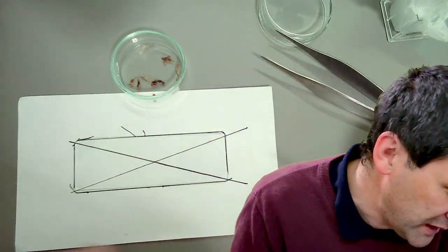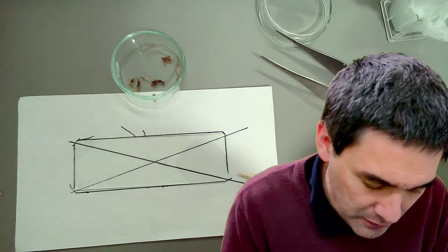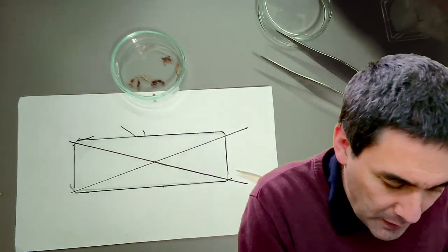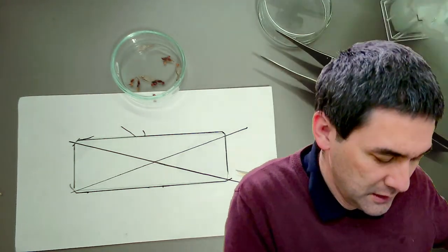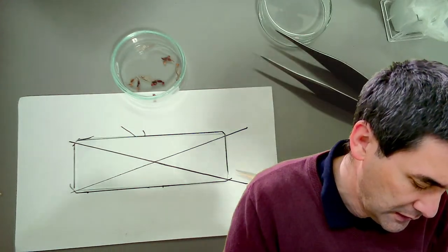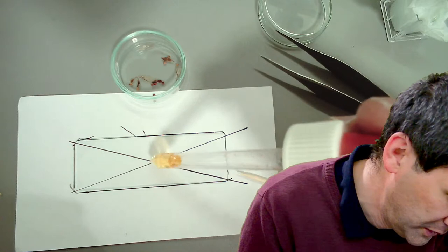So let's try it again. Let's try it again here. I put my cover glass somewhere. I put it over here on the side. And where is my mounting medium again? Again, a small drop here now in the middle.